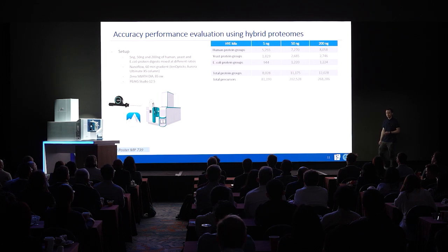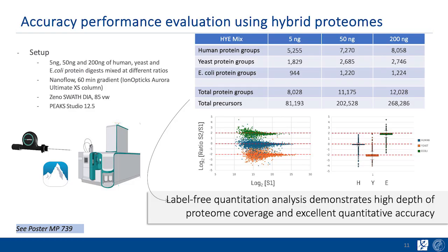So this was processed with Peaks. If you use DIA-NN, the results might differ, but they're not too different on the protein group level. And it's not just the identification and quantification, it's also the reproducibility, it's rather the quantitative accuracy that's also excellent. So here on these ratios, they are pretty much nailed perfectly. There's only small deviations that can be mainly attributed also to pipetting inaccuracies.